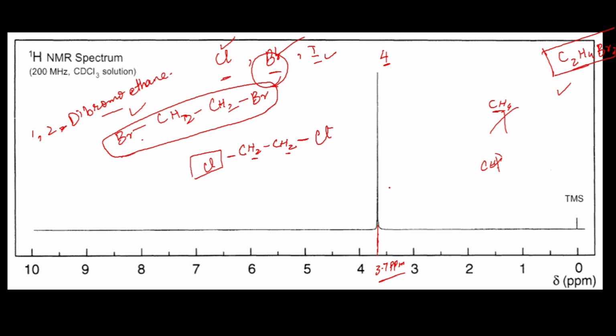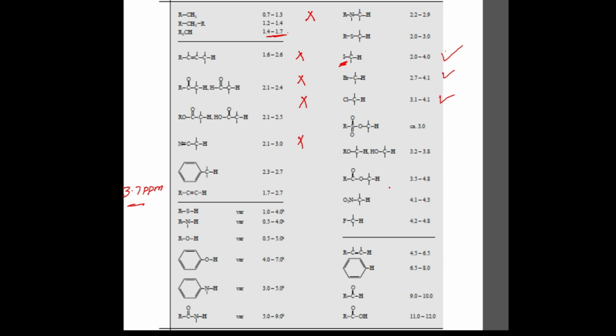Okay students, so now these are some chemical shift values. These are also very helpful for you. You may take this screenshot or you may learn it.